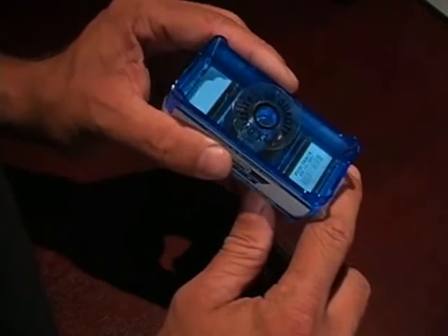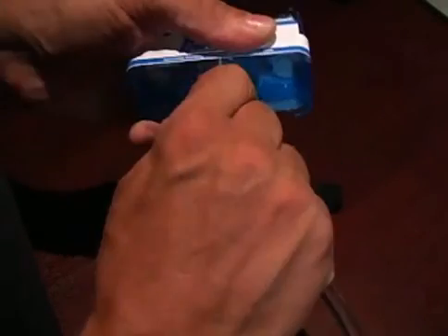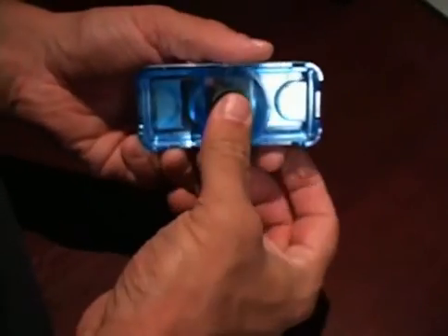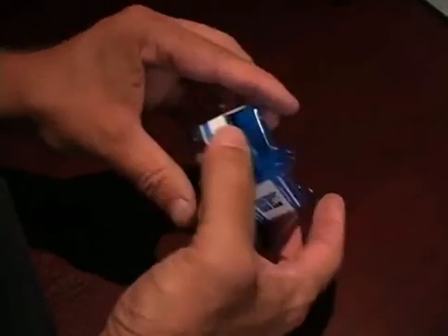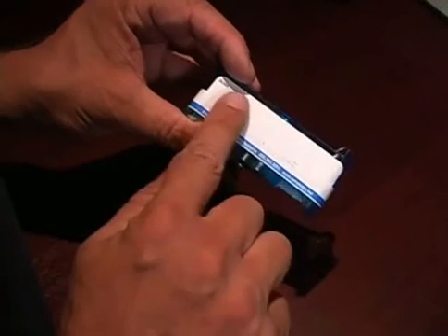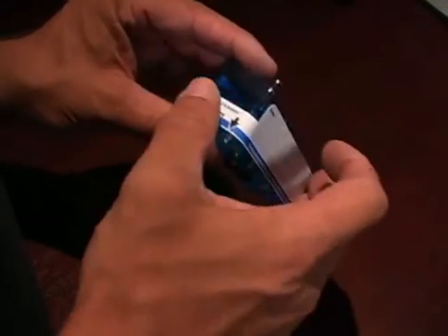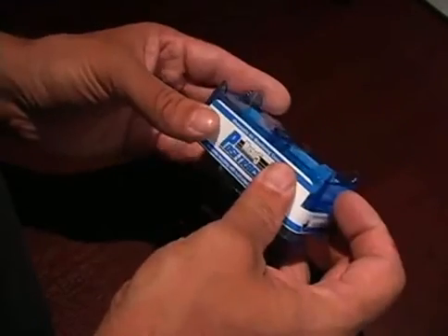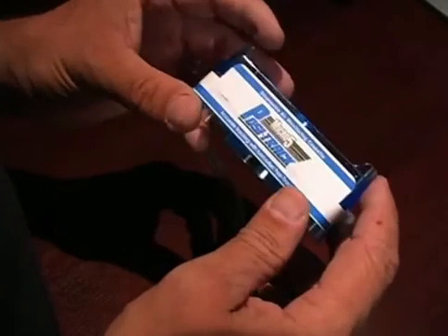Pull the bottom off your air pump source, replace the cap that we saved, that's on the bottom. You can make notes here. There's a very large area to make notes: location, ID, and then you're ready to go. Store it in an area 50 to 80 degrees, and do not use it in temperatures below 32 degrees Fahrenheit. It will be useless.